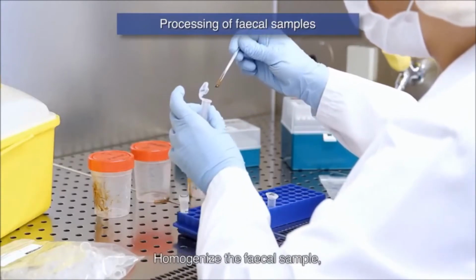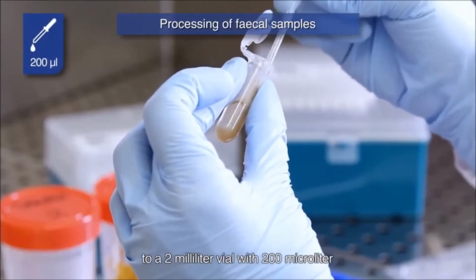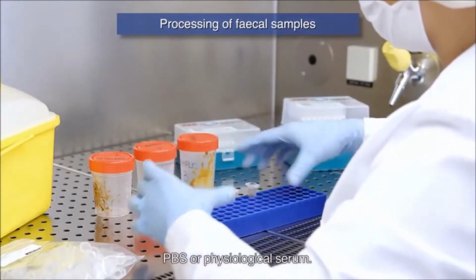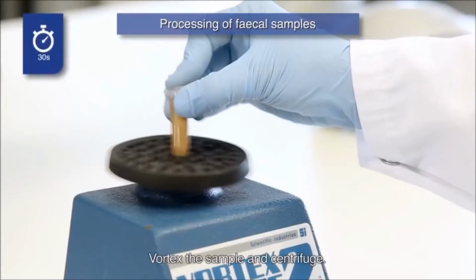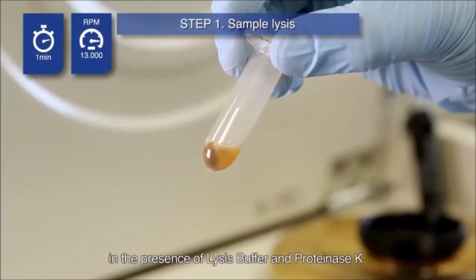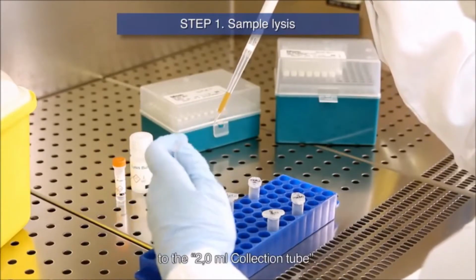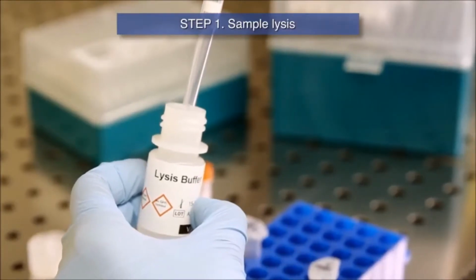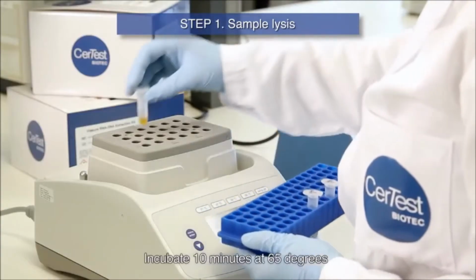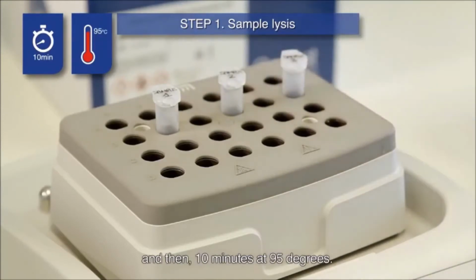Homogenize the fecal sample, collect a pea size and transfer to a 2 ml vial with 200 microliter of RNase DNase free water, PBS or physiological serum. Vortex the sample and centrifuge. Samples are lysed at elevated temperature in the presence of lysis buffer and proteinase K. Transfer the supernatant to the 2.0 ml collection tube. Then add lysis buffer and proteinase K and vortex vigorously. Incubate 10 minutes at 65 degrees and then 10 minutes at 95 degrees.